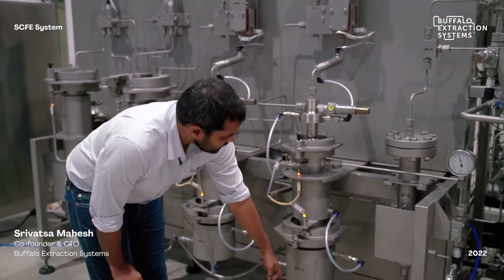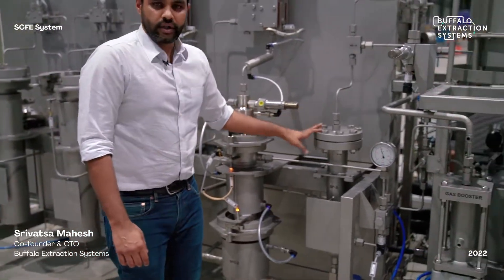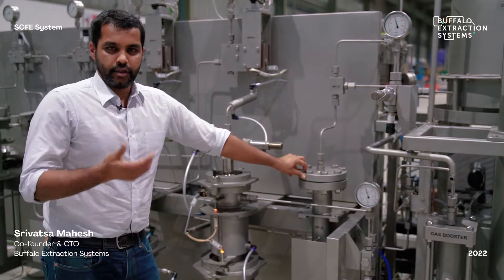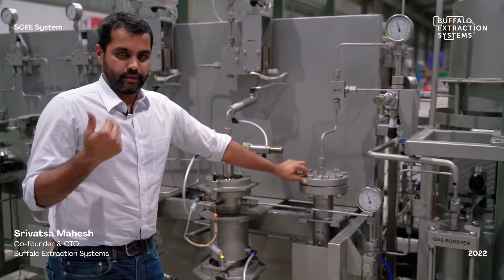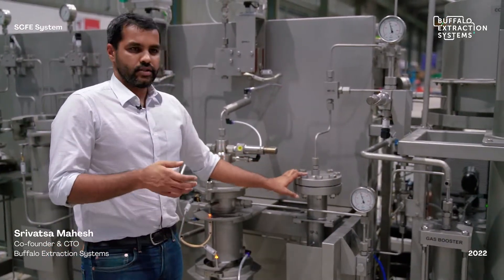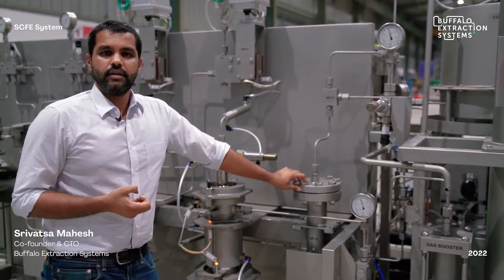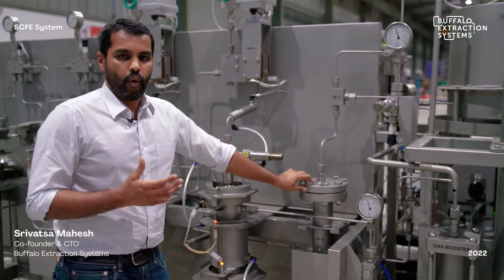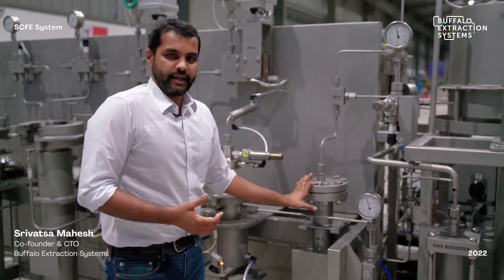After the second separator, the flow passes into a water separator, which collects all the volatiles, terpenes, and overall water from the biomass. This consists of a mesh that helps condensation of water into the separator.